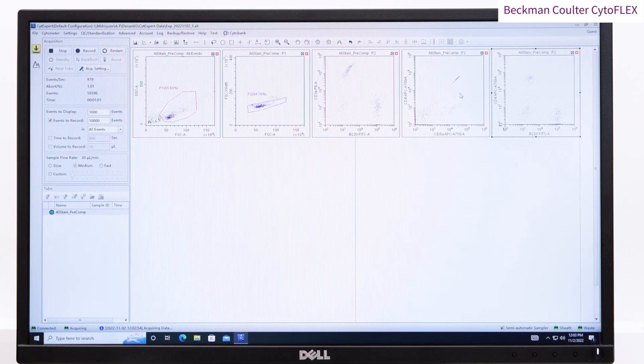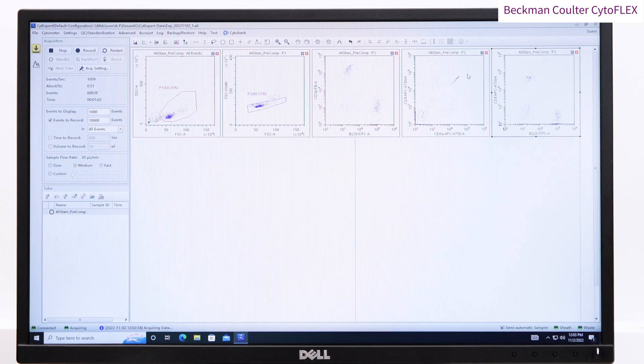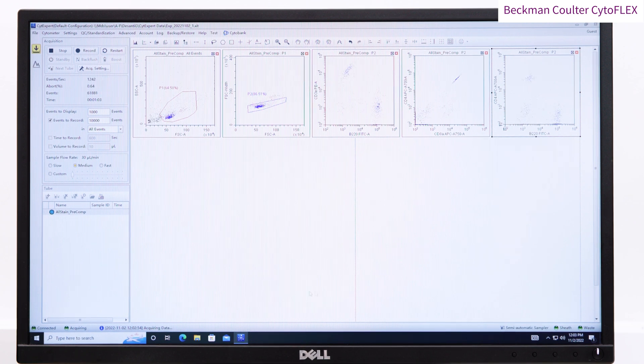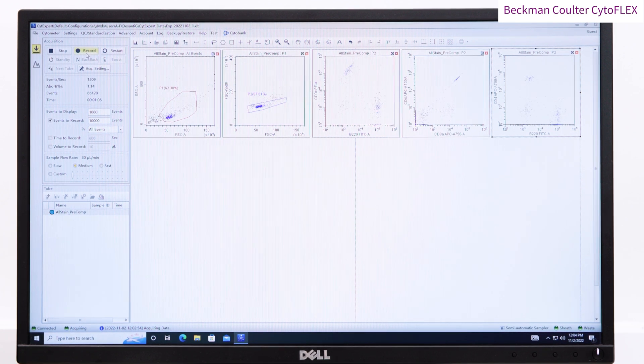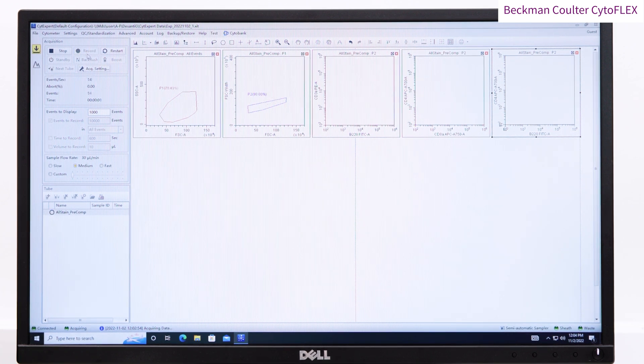You can see at the moment, the populations are difficult to resolve and that is because we haven't applied any compensation.